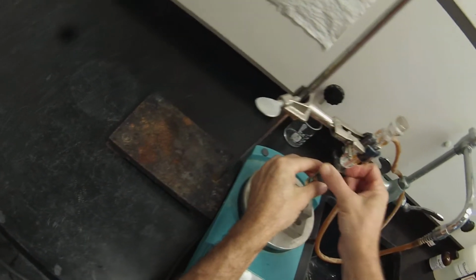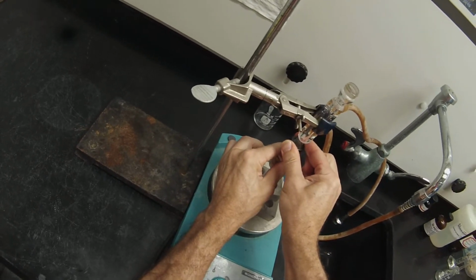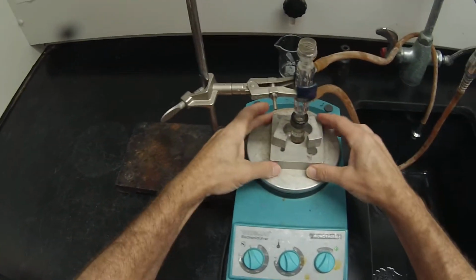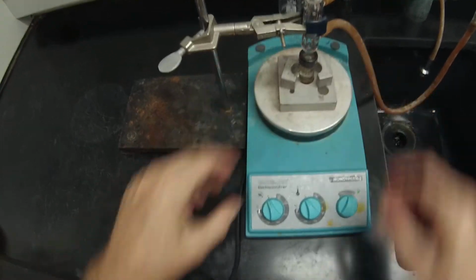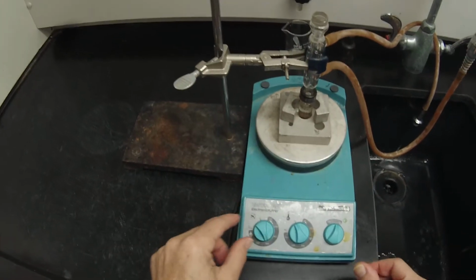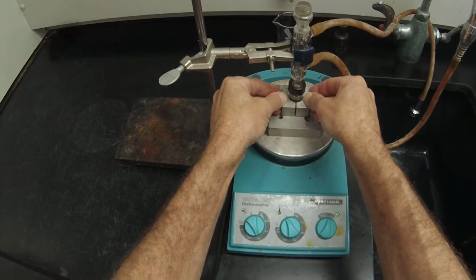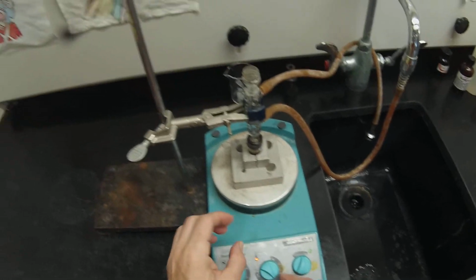And now I'm going to attach this vial to the bottom of the condenser and screw that tight so the vial won't come out. And I can lower the assembly, lower that vial into the hot block, and turn on the stirrer to a setting of about 600. That'll stir it nice and vigorously, and if I have it centered it should say stirring. And then I want to heat this up to about 140 so it starts refluxing, and that will require a setting of maybe 180 on the hot plate.